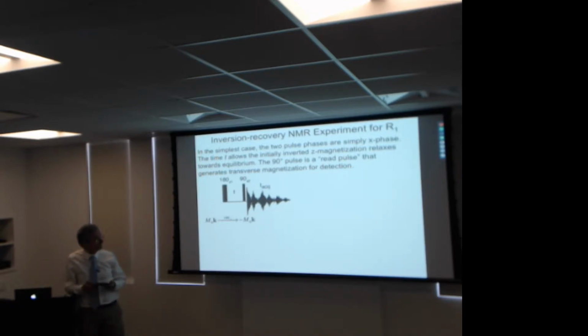So here the signal starts on Z. A 180-degree pulse turns the signal upside down. Now there's no precession, but there'll be T1 relaxation. The magnetization will start to relax back according to the T1 of the signal. So I've just added in the solution to the differential equation from the Bloch equations for T1 relaxation. And then at the end of the period T, we have another pulse that we could imagine, in the simplest case, as an X or Y 90-degree pulse.